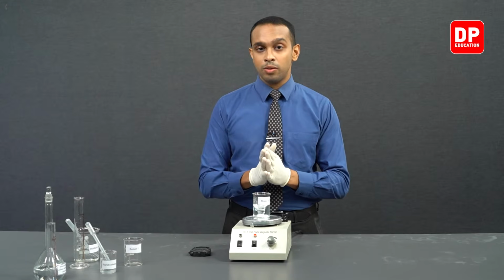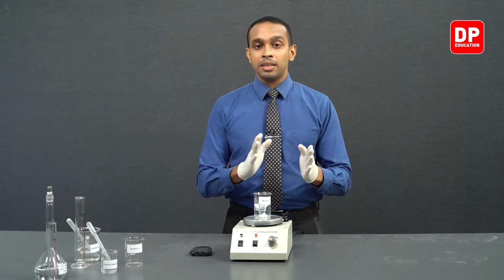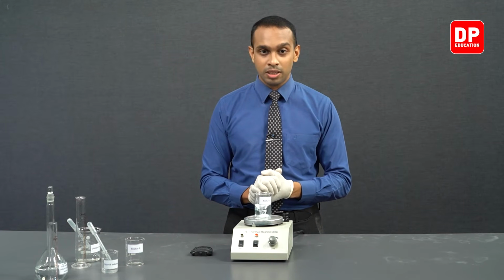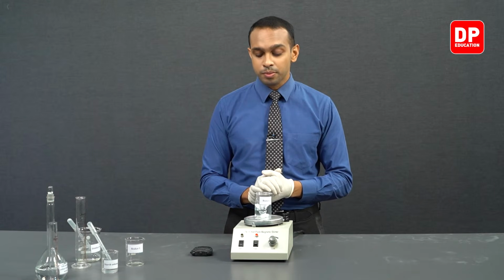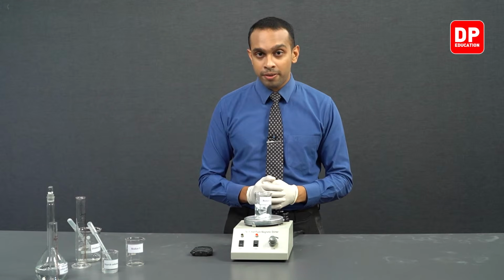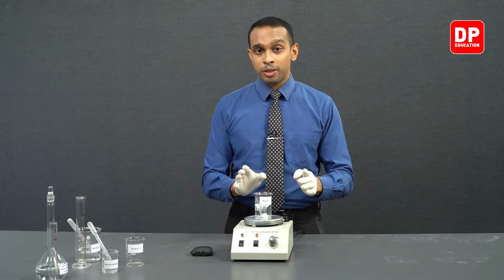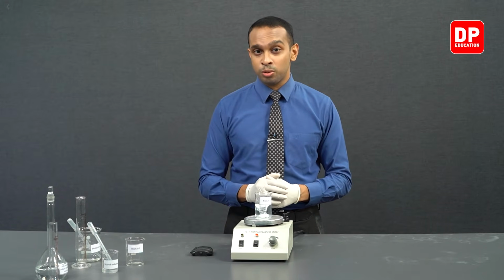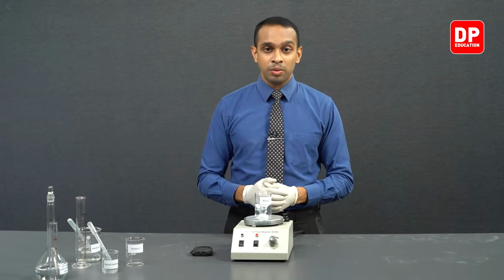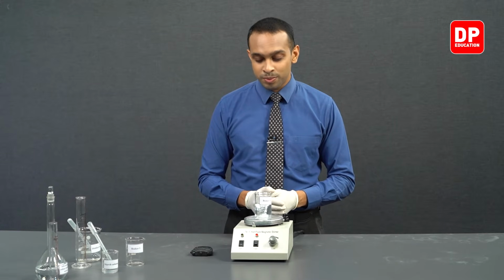However, the produced iodine was not sufficient to react with and completely finish the amount of sodium thiosulfate present in the medium. Therefore, we do not see a color change here because the amount of thiosulfate ions present in the medium was more than sufficient to react with all of the I2 produced through this reaction. So there was no remaining I2 to react with the starch that we added to this aqueous medium.